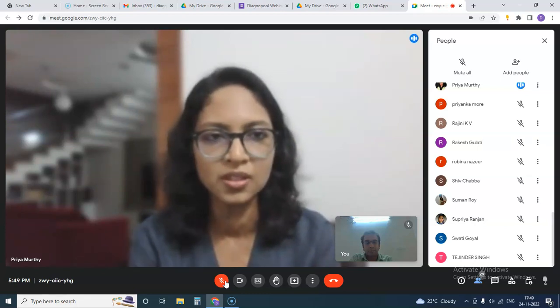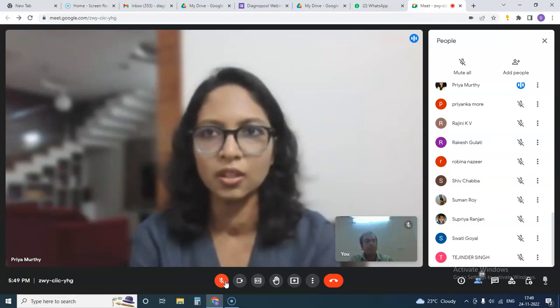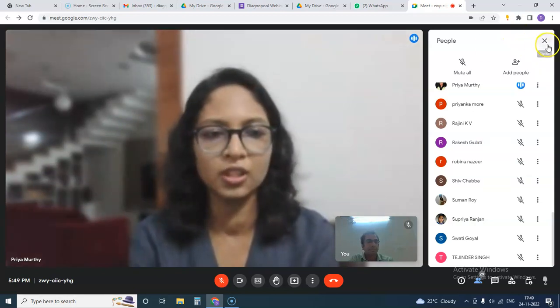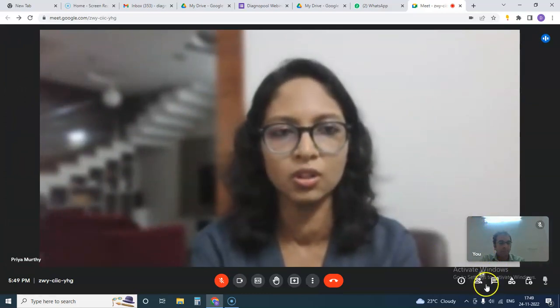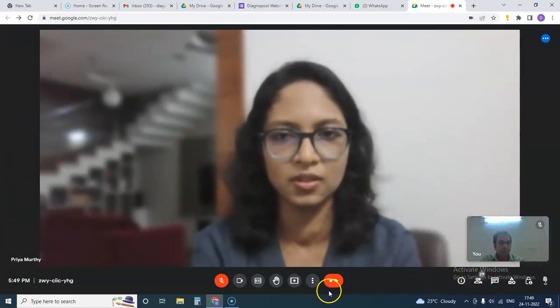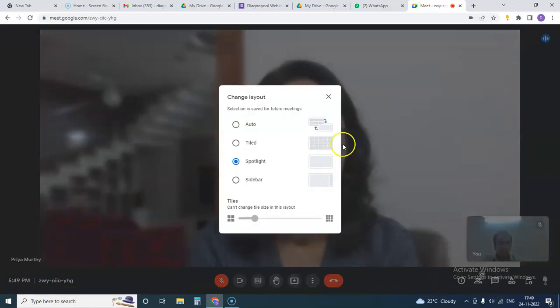So if direct smears are made at the site of aspirate, it is very useful because there are no artifacts involved. Whenever there is EDTA, some artifacts usually creep in, which can alter the morphology of the disease. And always clinical history is very important.